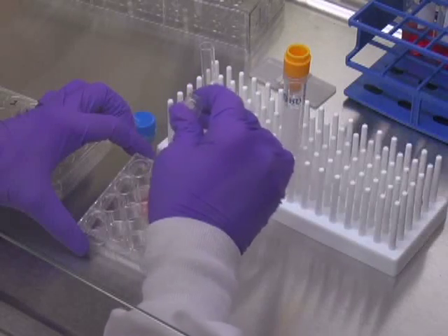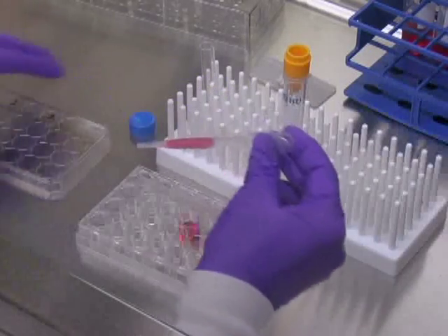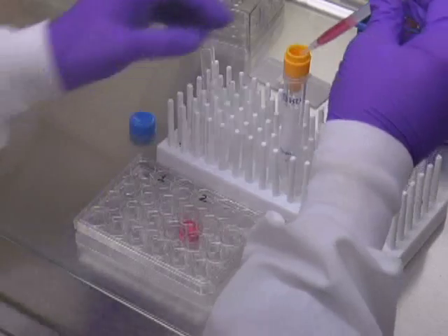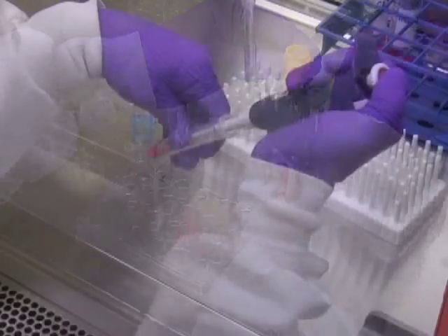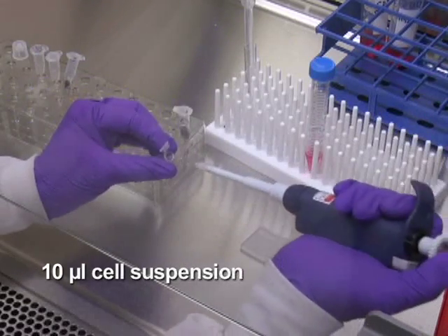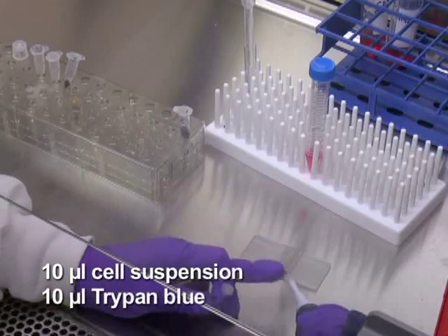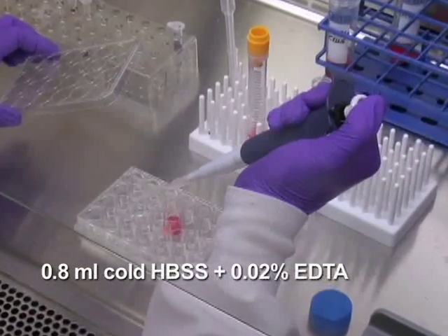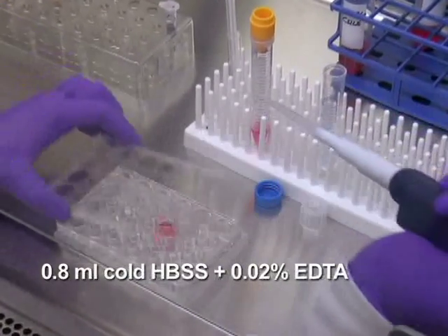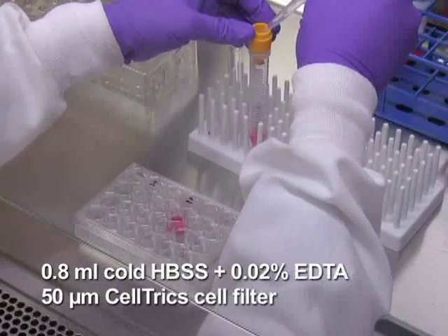In order to harvest the transduced cells, gently but thoroughly suspend the cells from the virus-loaded plates and filter the suspension through a 50 micron cell filter into a conical tube. Take 10 microliters of the cell suspension into a microtube, mix with an equal volume of trypan blue solution and count cells using a hemocytometer. Rinse each well with 0.8 milliliter of cold HBSS with 0.02% EDTA and add to the same collection tube through a 50 micron Celltrix cell filter.